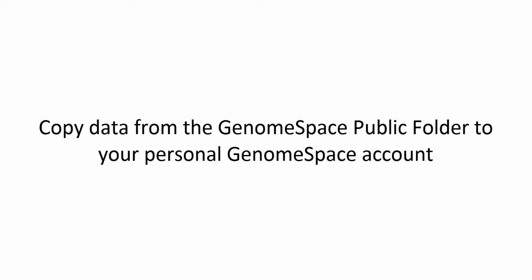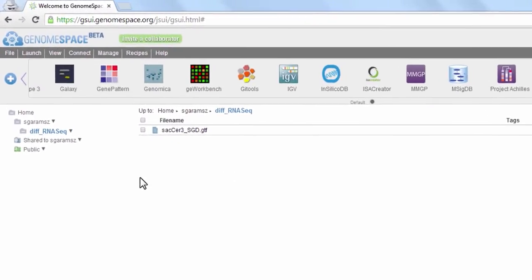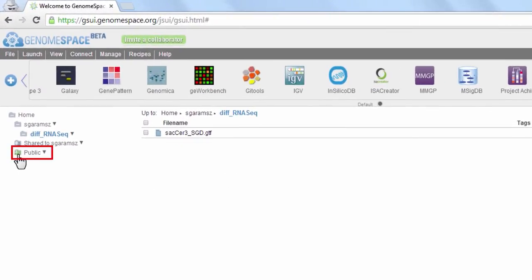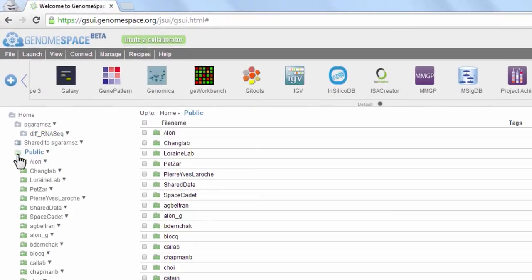Next, we will cover copying data from the GenomeSpace public folder to a personal GenomeSpace account. Let's start by navigating to the public folder through the sidebar. Files shared as public can be accessed by any GenomeSpace user through the public folder.